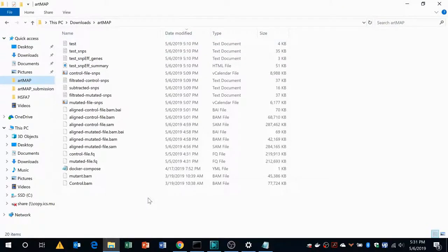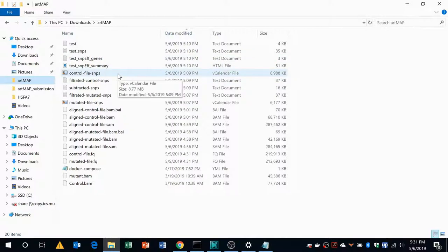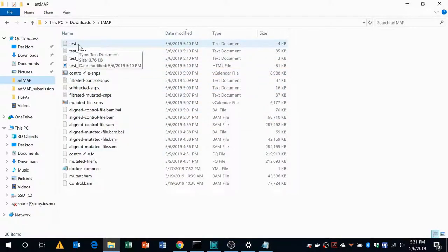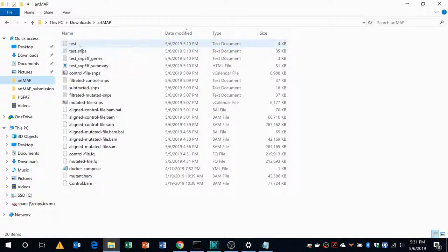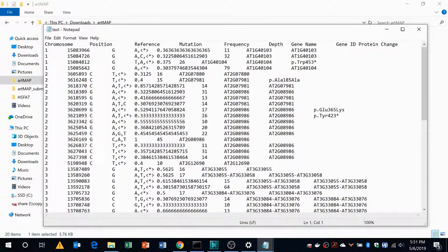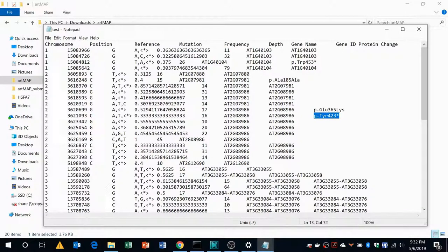You can also access the intermediate file coming from each step of the Artmap analysis from the folder where you asked Artmap to store the output. All the intermediate files are stored in this folder and there is a file which is named after your output. This file will contain all the information necessary for the final mutation along with its corresponding frequency, depth, annotation as well as if there is any amino acid change.